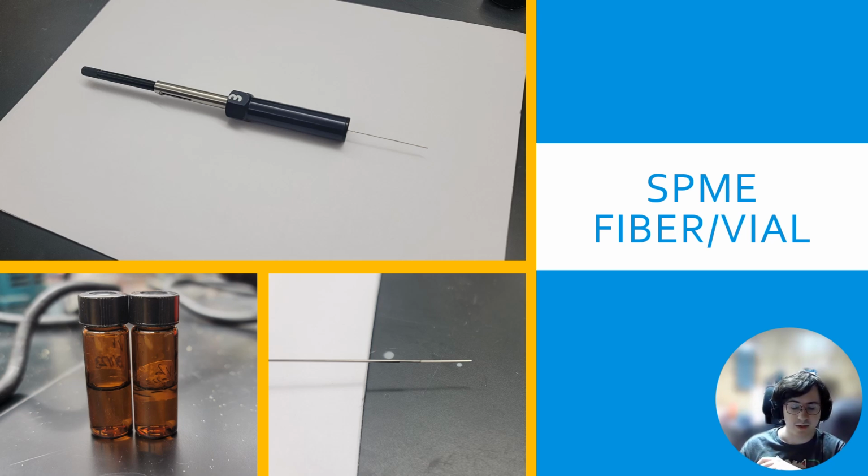And then on the bottom left, we see some amber vials. That's what I used for this experiment. There are the amber vials with the little spin bar at the bottom that contain 2 milliliters of liquid, and I believe those are 4 milliliter amber vials. And then the zoom-in on the right shows how small that fiber actually is. It is very small, 50 to 30 microns. There's a 50 micron coating and a 30 micron coating, so it's incredibly small and incredibly fragile. Very easy to break.